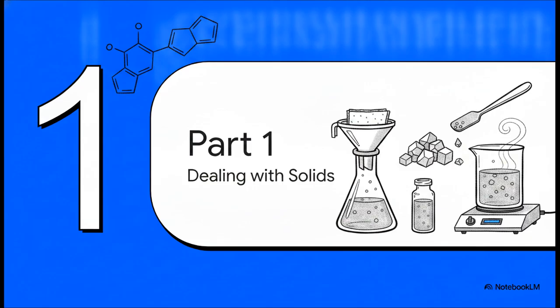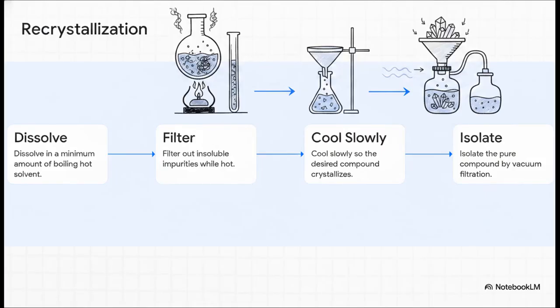All right, part 1, dealing with solids. Okay, let's dive into this. The techniques we're talking about here are literally foundational to almost every organic chemistry lab on the planet. The bread and butter for purifying an impure solid is an elegant physical process called recrystallization, and it relies on a very specific, carefully timed sequence.